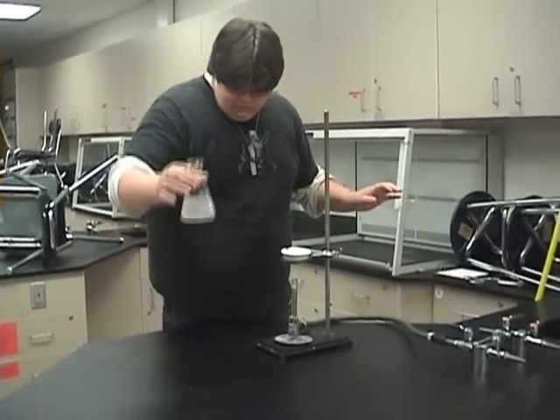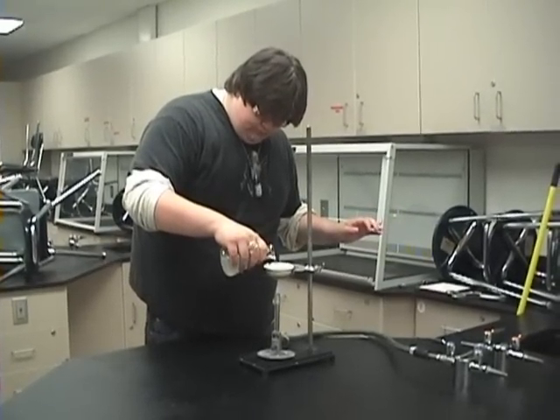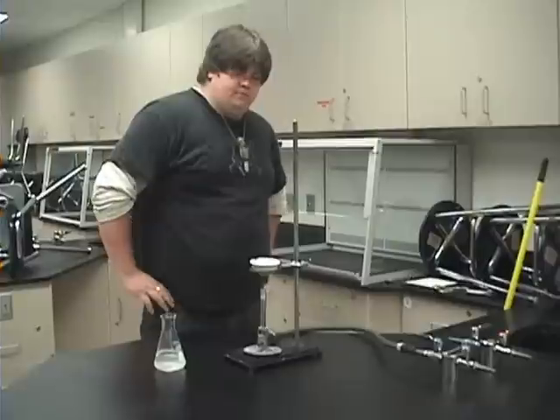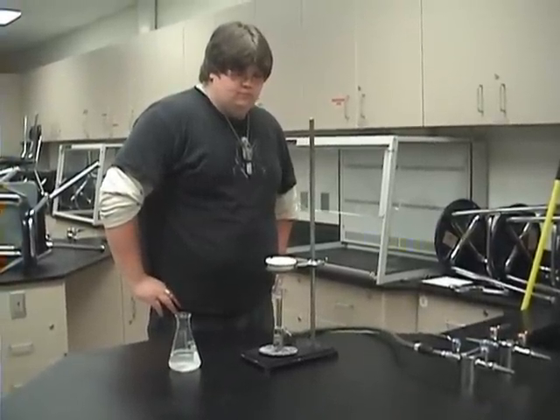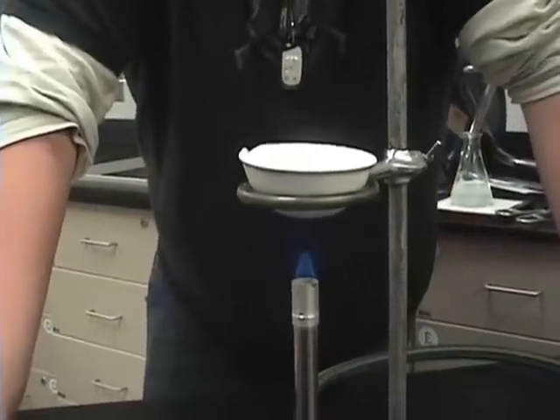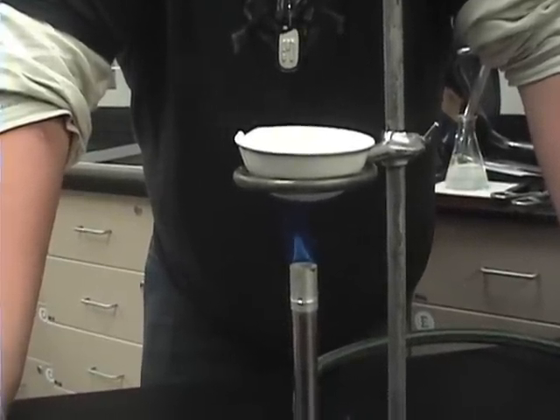Then you put this in here. And now we play the waiting game. It is evaporating.